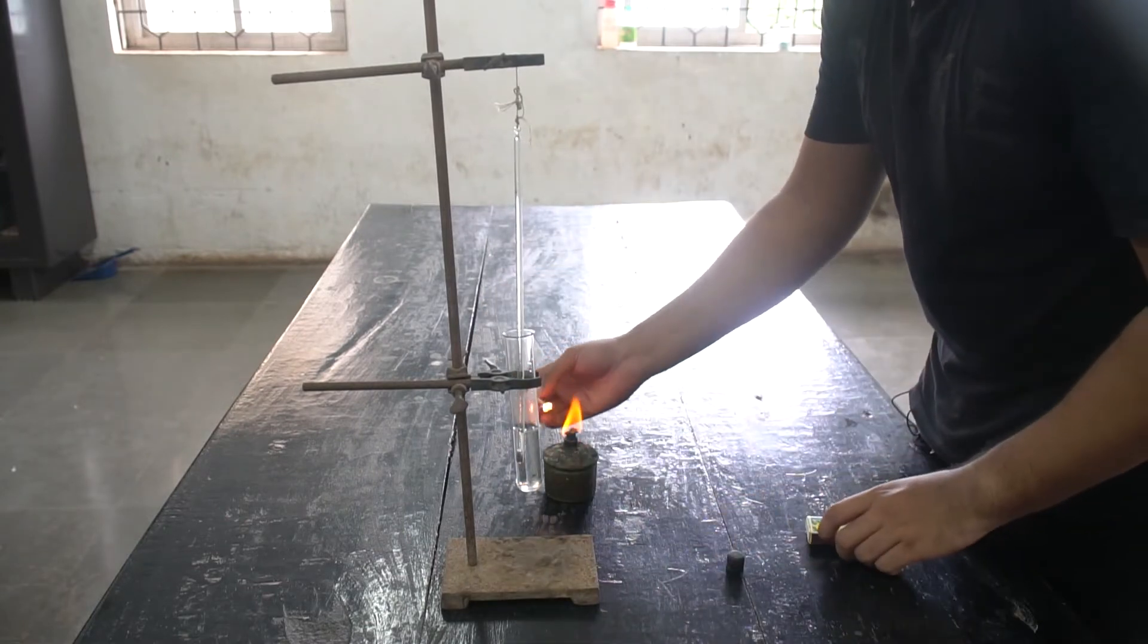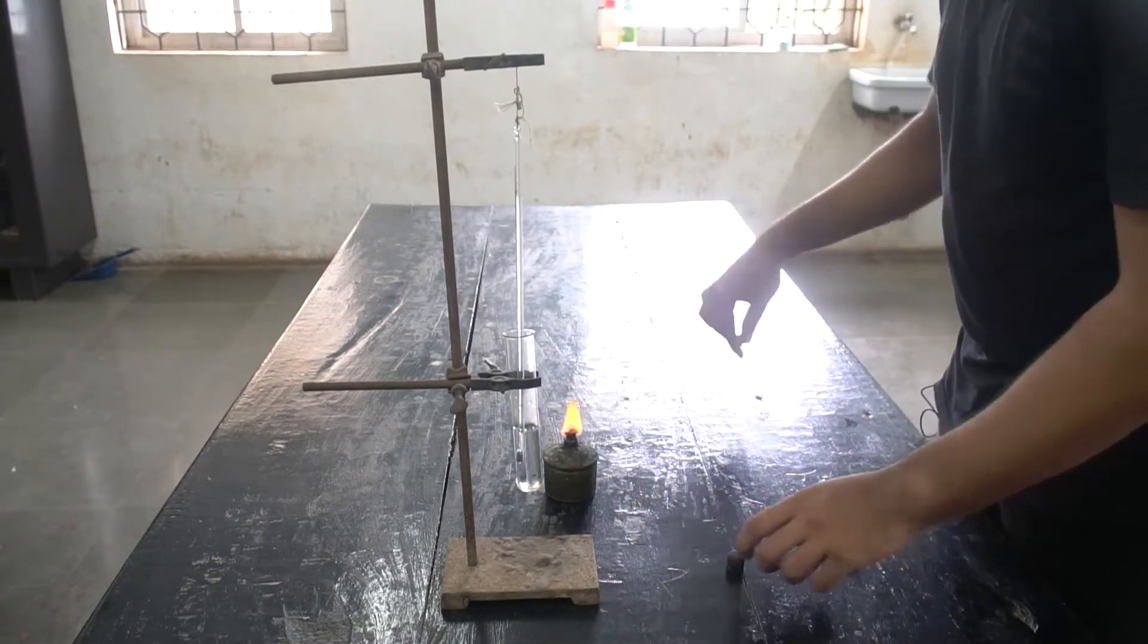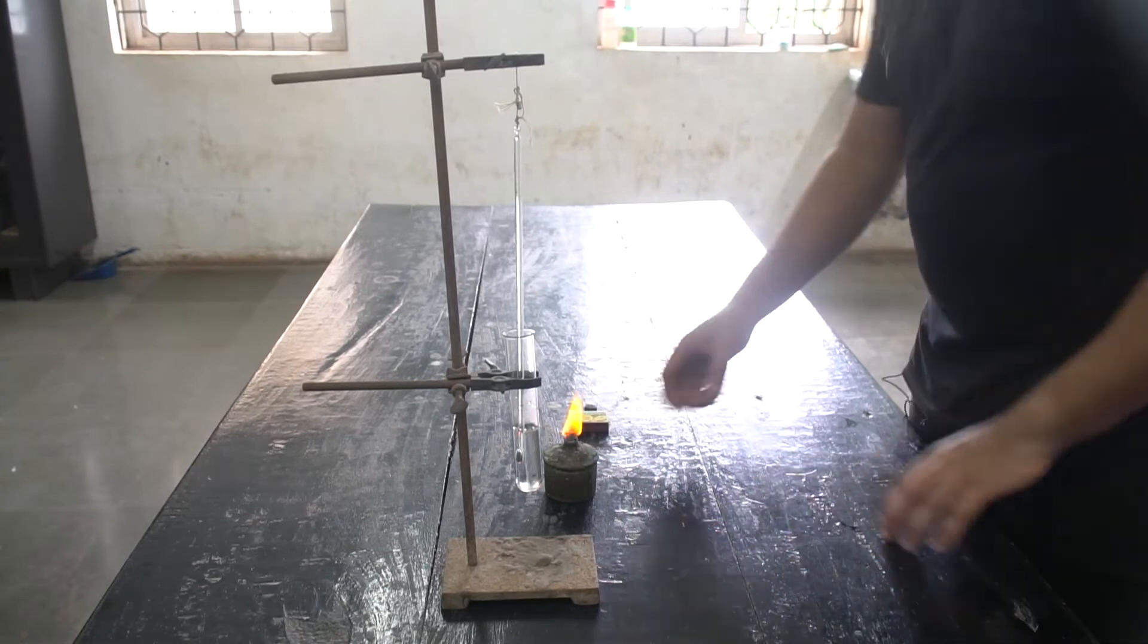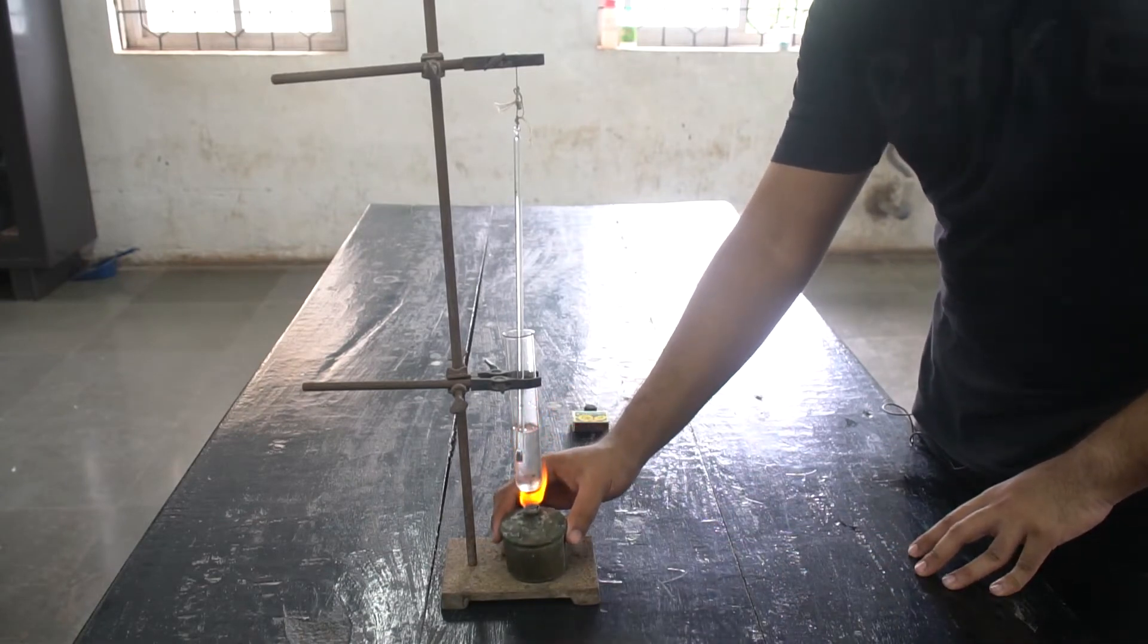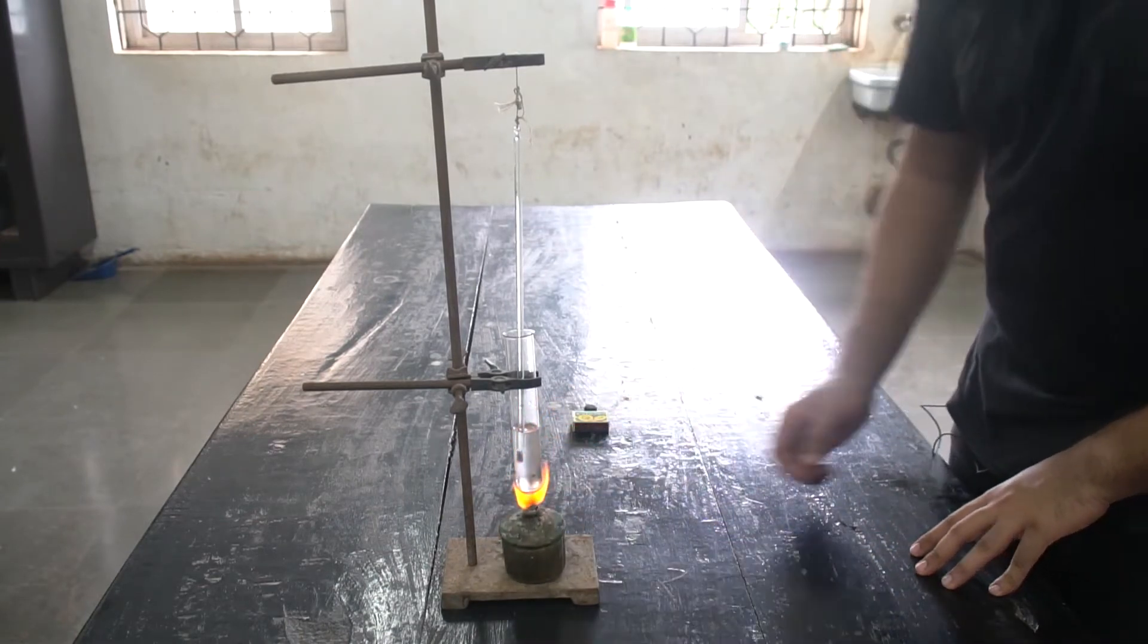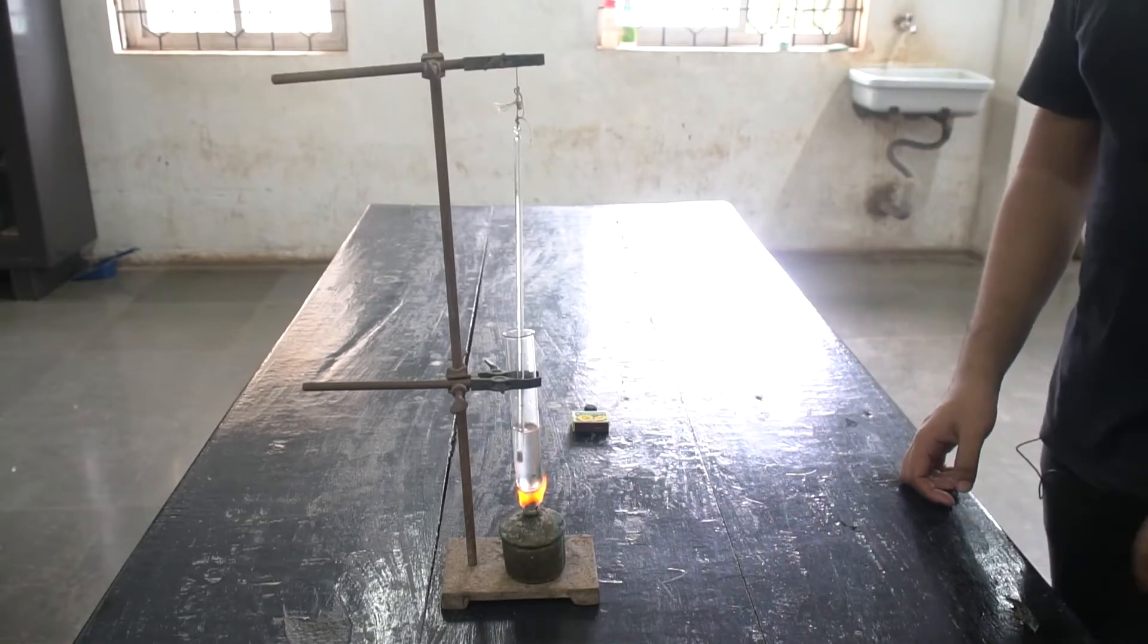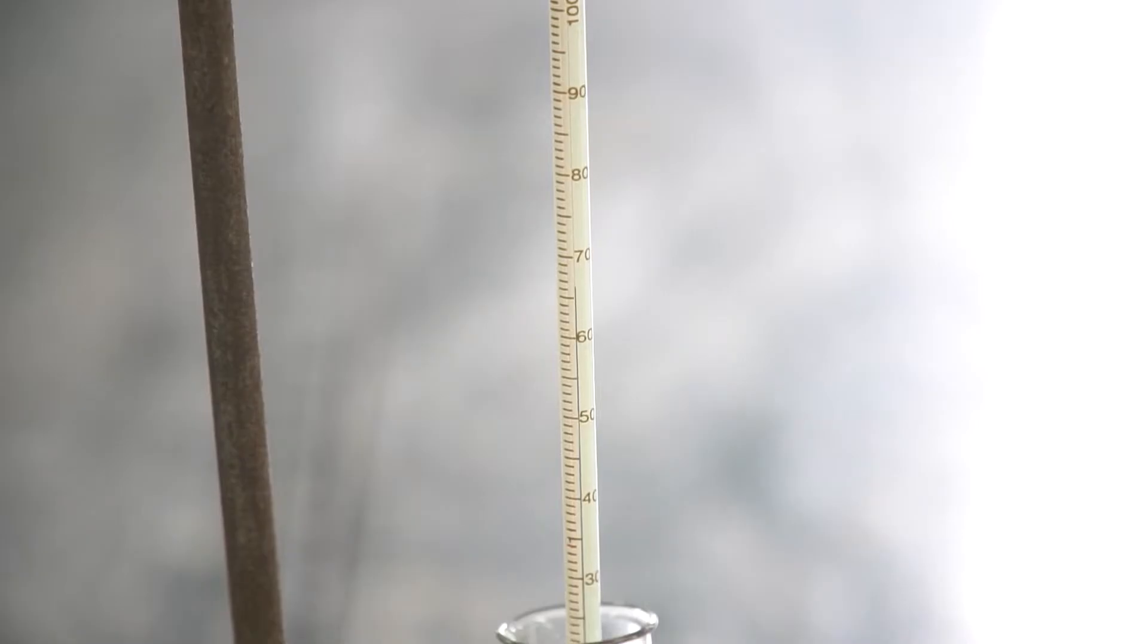the spirit lamp and carefully place it under the test tube, making sure that the wick of the spirit lamp does not touch the test tube. You will notice that the temperature on the thermometer will start to rise.